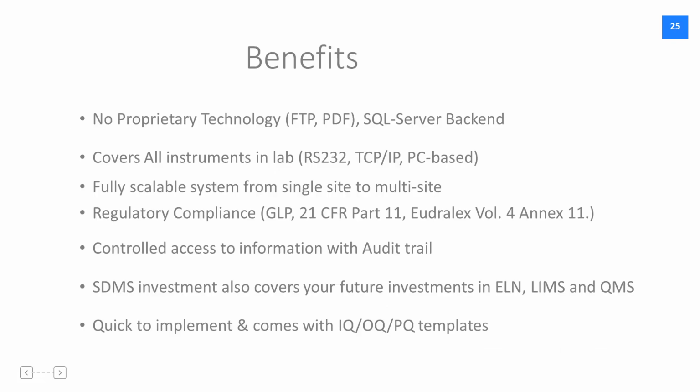Logilab SDMS does not use any proprietary technology. The technologies that we use are very standard and they are industrial standard technologies like FTP, PDF, SQL Server database backend. All of them are non-proprietary systems. Logilab SDMS covers your entire laboratory. That means all types of instruments, including standalone instruments and PC-based instruments and database-oriented instruments.